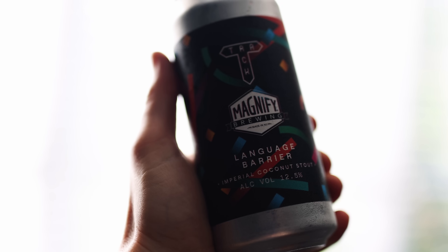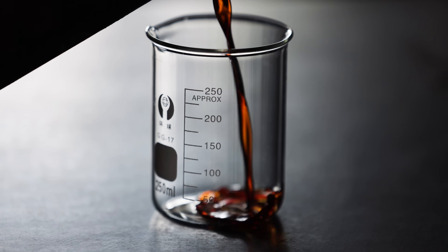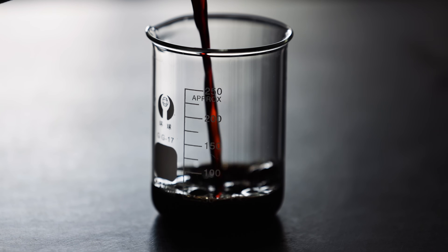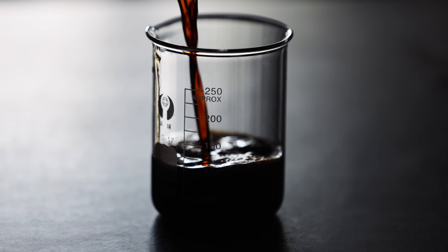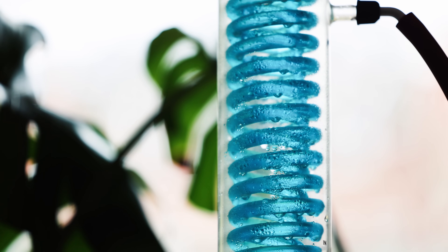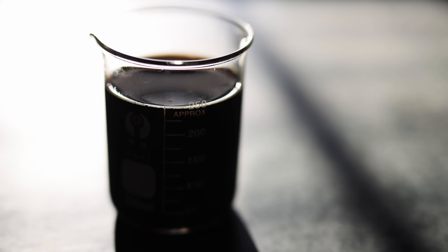The last thing I'll mention before the pros and cons is that you can also use the Rotavap to remove alcohol from things. Here you're essentially distilling but treating the alcohol as the byproduct. You might want to do this if you want to reduce the alcohol content of something — say you're using it in a frozen dessert and it's depressing the freezing temperature too much, or there could be various instances where you want the flavor from something but not its natural alcohol content. I might want the flavors of a stout to pair against cheese, but perhaps not its alcohol, so the Rotavap gives me a way of doing this at low temperature while preserving those flavors.